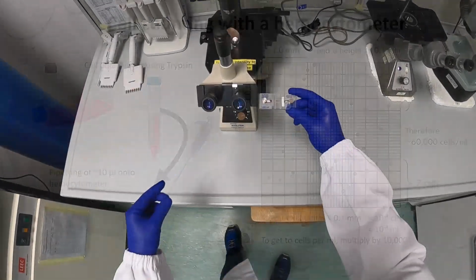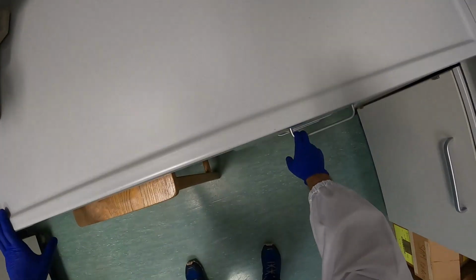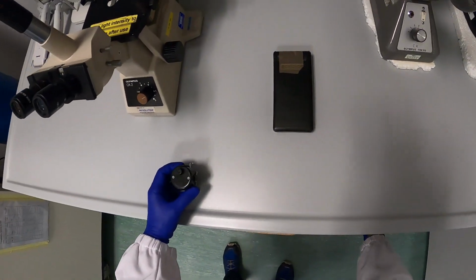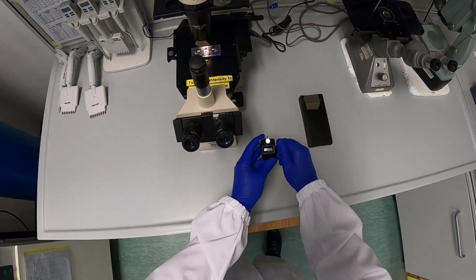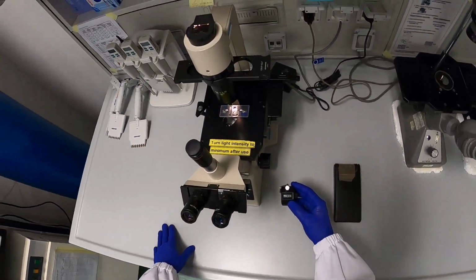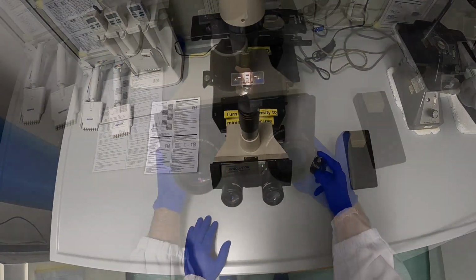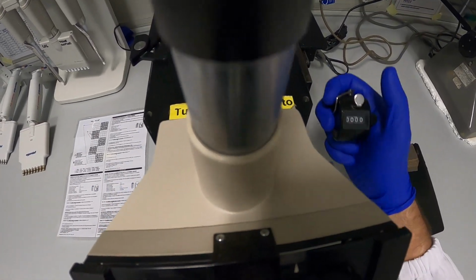So let's start placing the hemocytometer under the microscope. Again, get the calculator and the counter. Make sure it's set to 0, like that. And now it's just simply a matter of counting. I wanted you to have a look at the grid, but we know what we are looking at. And there you go.